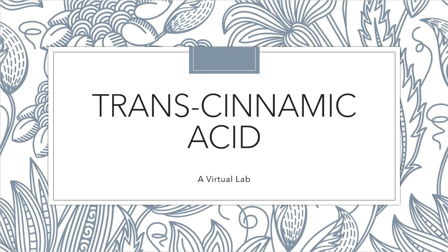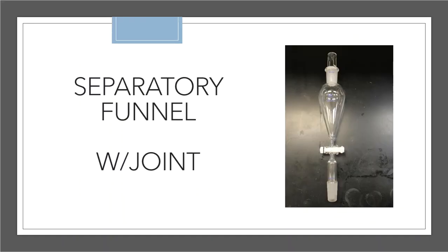All right, so if you want to know more about the background, that's where you're going to find this, in the pre-lab videos. So let's talk about the actual lab part. That's what we're here today to discuss, isn't it? And one of the first pieces that we're going to have is a separatory funnel.